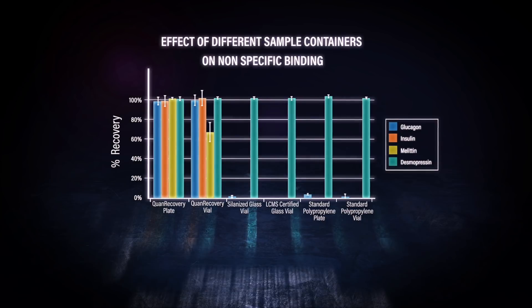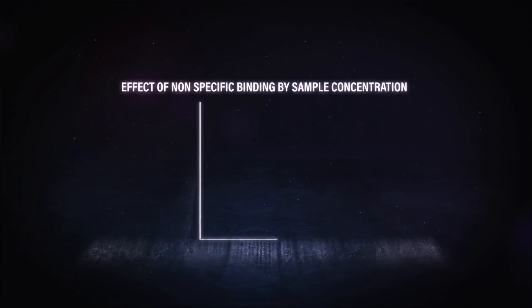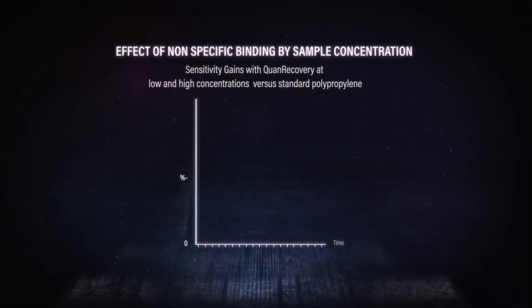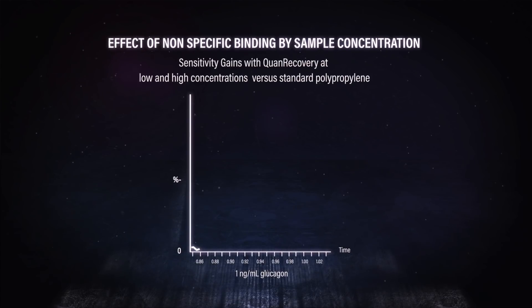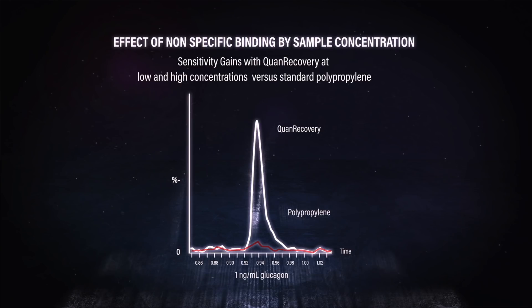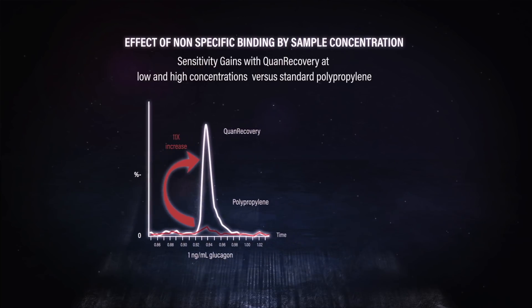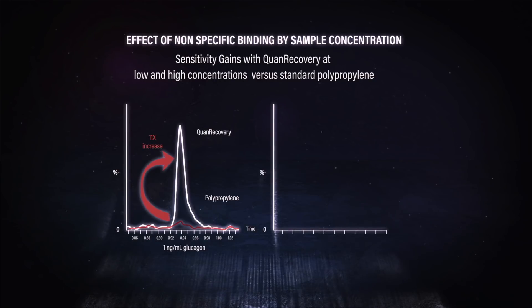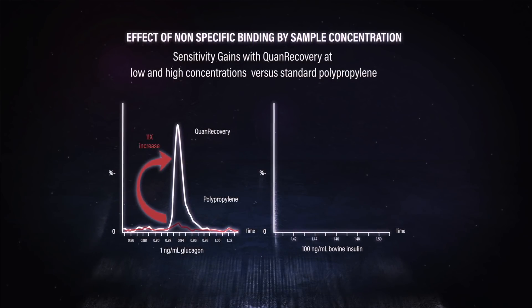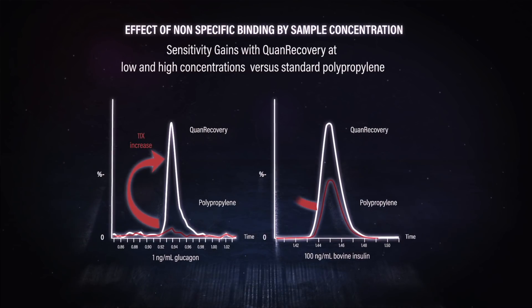We didn't add a carrier protein here — we just wanted to see the pure effect of the container on nonspecific binding. To really address the scientist's question, it was important to look at different concentrations of peptide. At one nanogram per mil of glucagon, comparing an optimized container to a standard polypropylene container, we actually get an 11-times increase in signal with the optimized container. That's at a very low concentration — which is where we expected the problem to be. But remarkably, even at a high concentration of 100 nanograms per mil of bovine insulin, comparing the optimized container to a standard polypropylene container, we still see a two-times increase in signal.